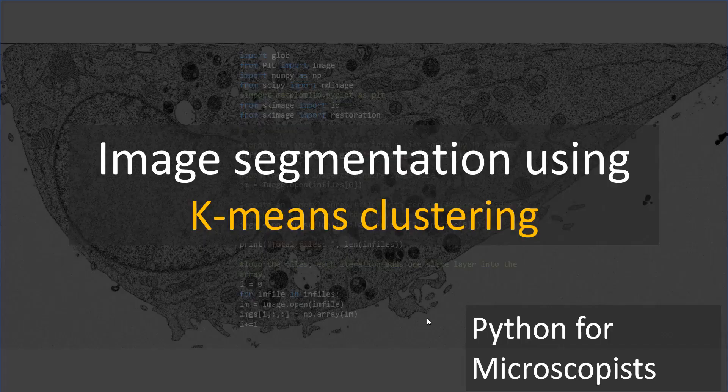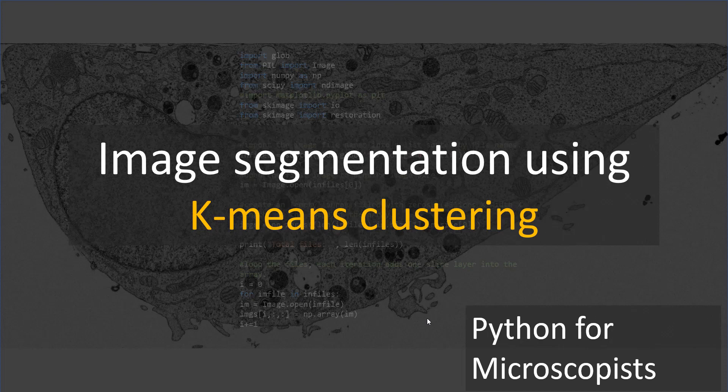Hey guys, you're watching Python tutorial videos on my YouTube channel, Python for Microscopists. In the previous tutorial, we talked about the basics of k-means clustering and tested a few lines of code using some made-up data. Now in this tutorial, let's actually try to segment an image using this technique, the k-means clustering technique.